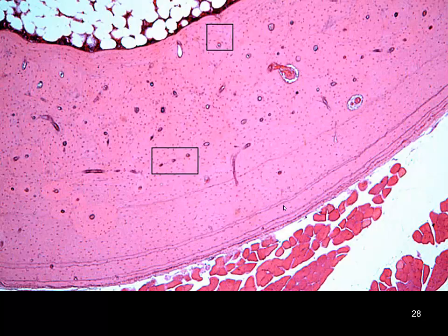So once again, we're looking at the outside of the bone. The periosteum would be here. We would have our circumferential lamellae. We have our Haversian canal systems. And then we have our Volkmann's canals, which you see in longitudinal section. That's how you're going to know they're Volkmann's.